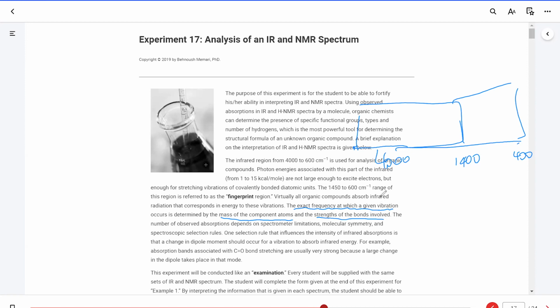Strong bonds usually have peaks at higher energy, like OH. You have a strong bond, and the peak appears at 3,300. For alcohol, a broad peak with a round tip is the specification for the OH. And then you have a C=O double bond that appears at 1,700. I use this because it's a peak that has been studied in previous experiments, and we have prior knowledge about it.